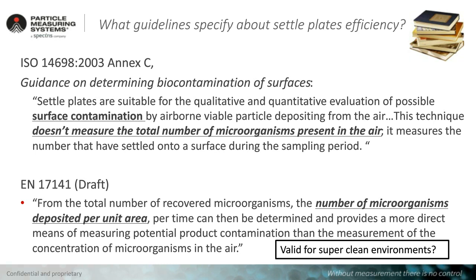the air. That's true. But is that really true, and is it really valid for a super clean environment with high turbulences? We just learned that especially when we have high airspeed, there is a cleaning effect from the airspeed that will, in the end, remove these MCPs from the air and will prevent them from settling.